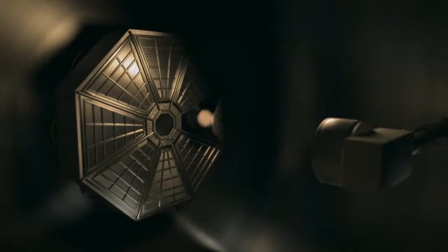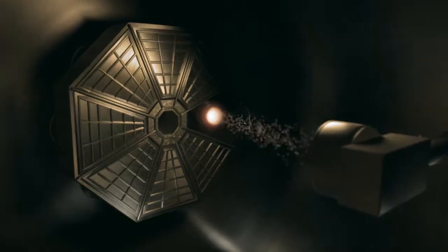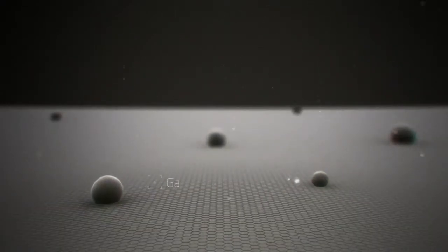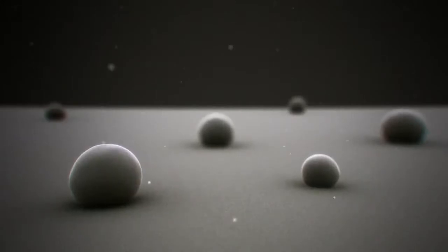Here, inside the MBE chamber, we first open the flange to the heated gallium source so that an atomic flux of gallium atoms is directed and then adsorbed on the substrate, which in our case is an atomic thin sheet of graphene. Here we see how the gallium atoms adsorb on the graphene surface. It turns out that the gallium atoms tend to stick to each other and form small gallium droplets on the graphene surface.